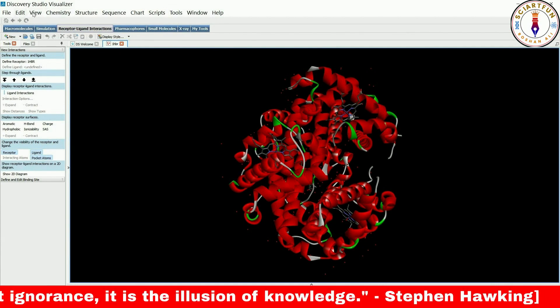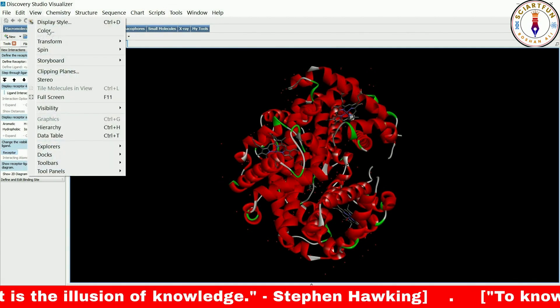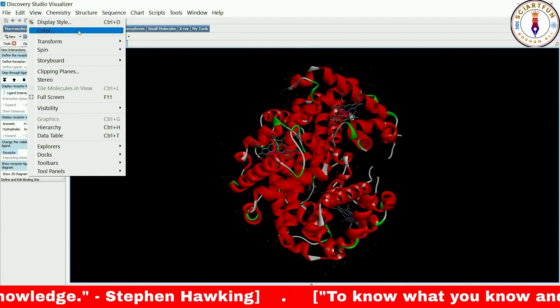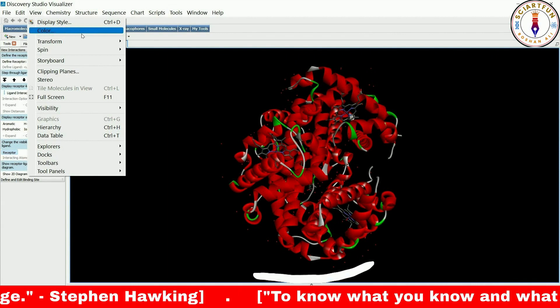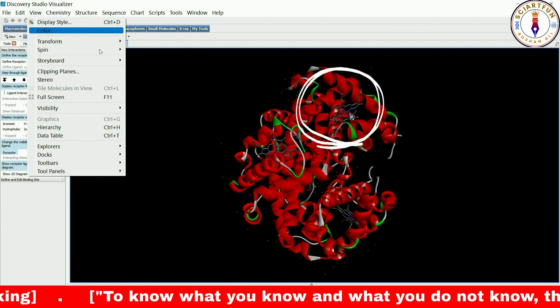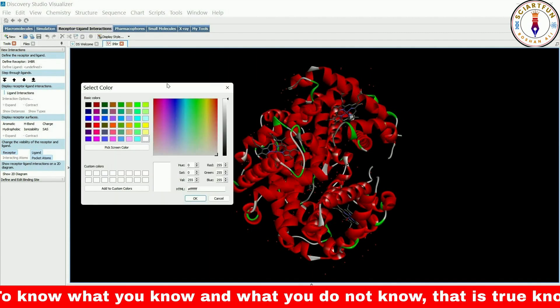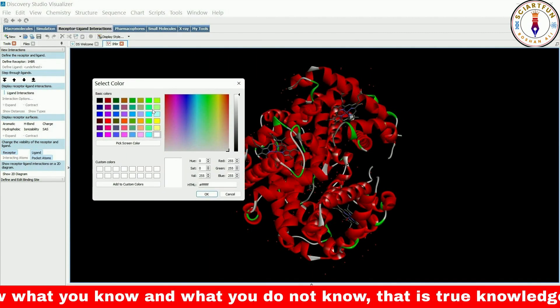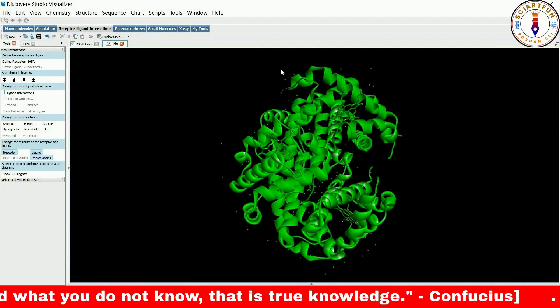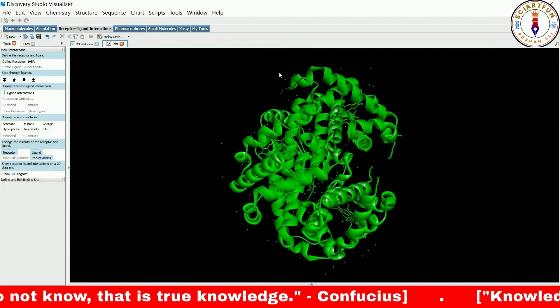Once the protein model is open, we will begin by discussing the Color option in the View menu. This option allows us to change the color of the entire model, a portion of it, or a selected part. Let's start by applying it to the entire model. As you can see, the color of the whole protein has changed.